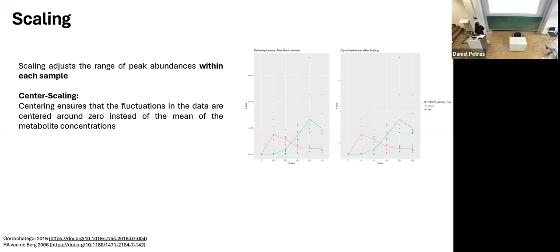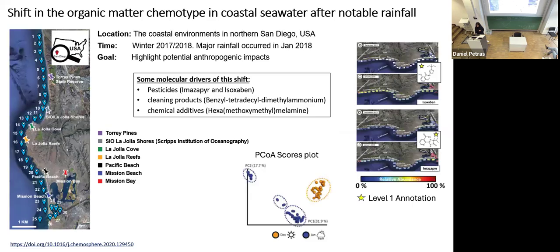So these are the steps that we do in the FBMN stats guide. And this is just for information, because we are going to use the example that we used for all these days. Yeah, that's all I wanted to say, and we could just jump into the app.